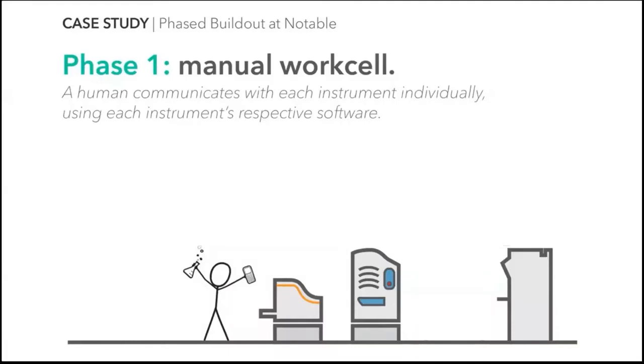So when we built out this particular work cell, we started out with what you might call a manual work cell. This is pretty similar to what you'll see in a benchtop lab without any automation. You've got a few instruments and each instrument does a certain job. Here you've got an incubator, an acoustic dispenser, and a flow cytometer.